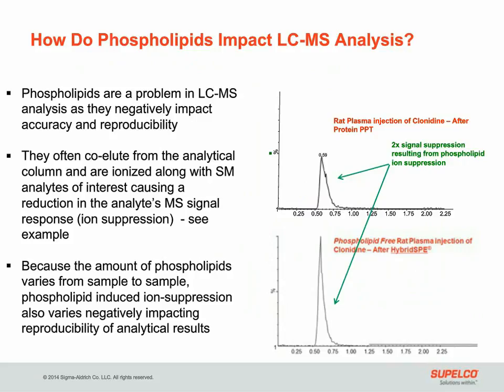So how do phospholipids impact LC-MS analysis? First, because of the variability in concentration, they negatively impact accuracy and reproducibility. This is because they often co-elute with analytes of interest and are ionized along with the analyte. As you can see from this example, the signal for clonidine was suppressed by the presence of phospholipids in the rat plasma. Differing amounts of phospholipids would vary the amount of suppression, preventing accurate measurement.